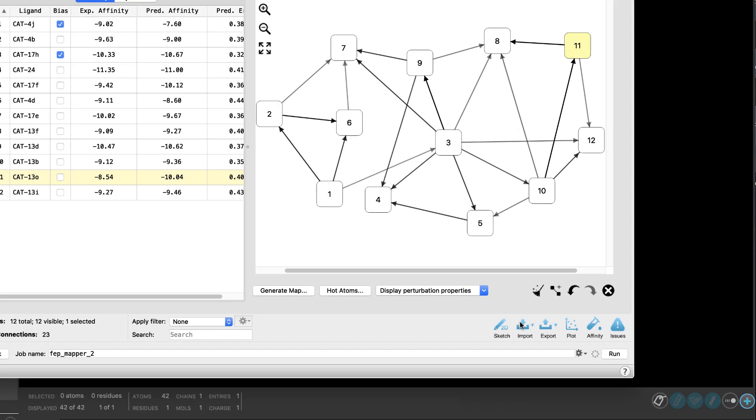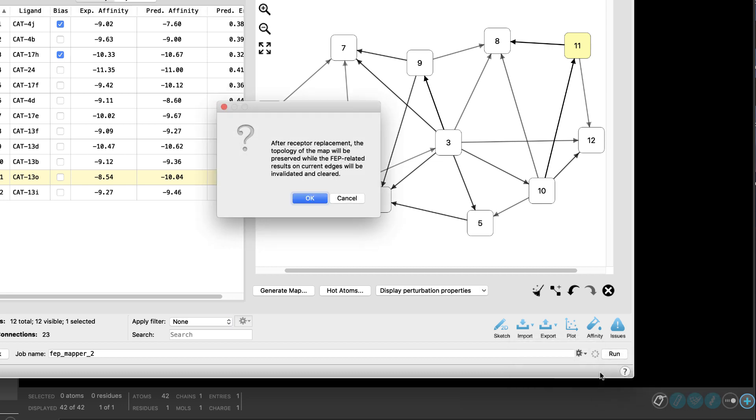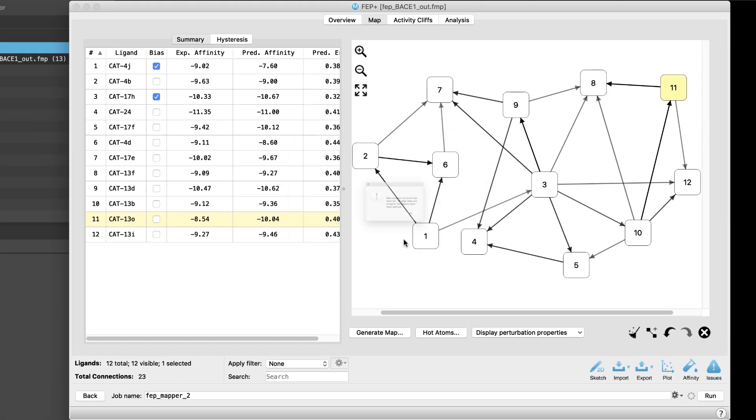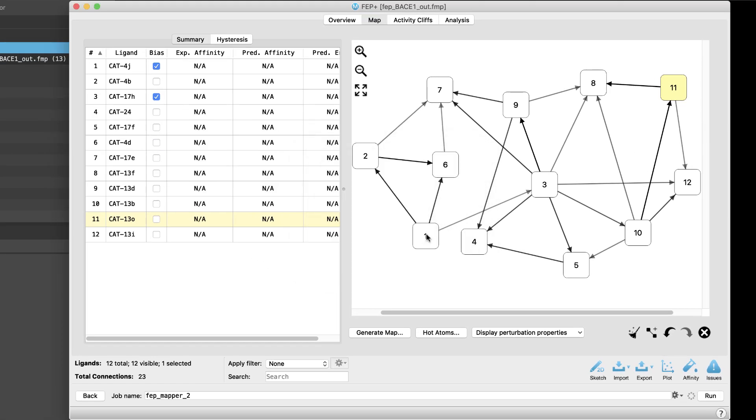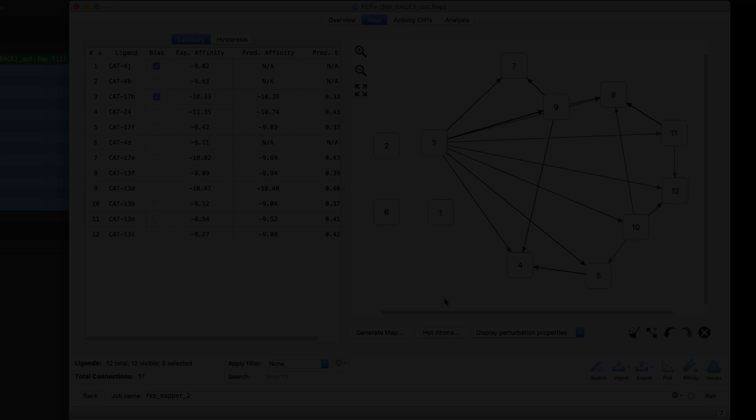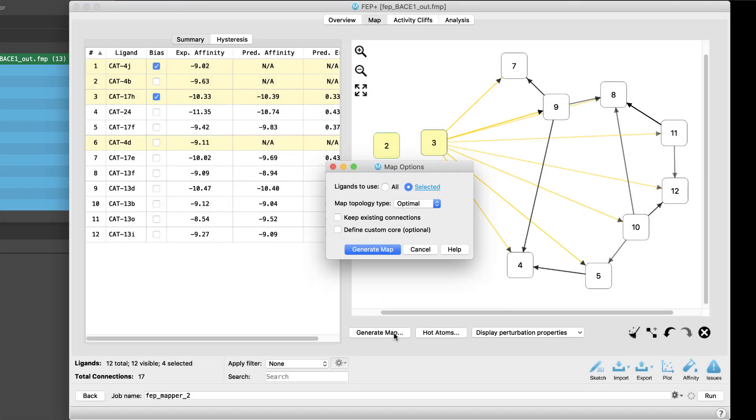A new ability to replace the receptor can be found under import. This option allows receptors to be easily swapped while preserving the topology of the existing map. Another enhancement is the ability to generate a map for the subset of selected nodes.